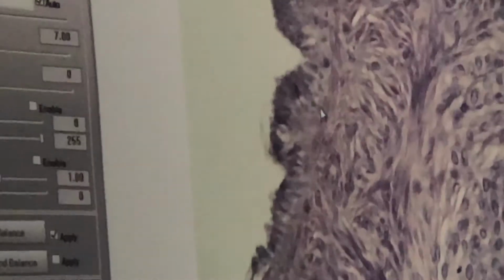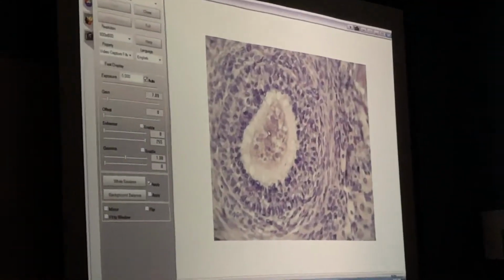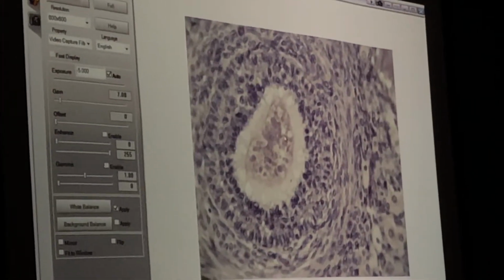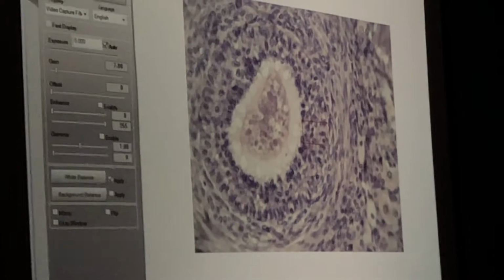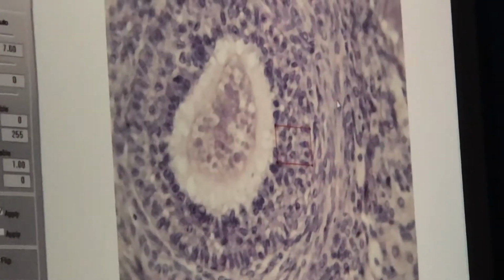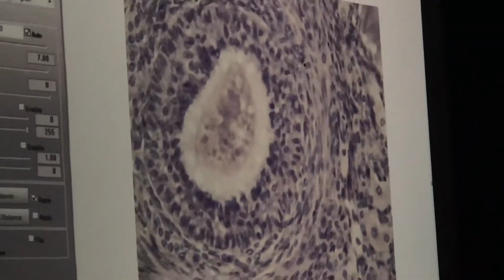There. I have a question. Yeah. Okay, it doesn't super pertain to this, kind of does, but when they harvest women's eggs to freeze, what stage? Yeah, I would say secondary. Why would I say that? Yeah, so this would be your ovum. It's a little weird. And then here's the follicle wall. So again, multiple layers. I'm not really seeing a whole lot for an antrum yet. So that would probably indicate I'm looking at early in the secondary follicle stage.